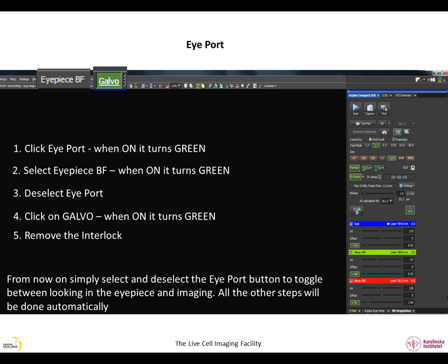If you do not follow these five steps at the start of your imaging session, you might end up imaging with the bright field lamp on.